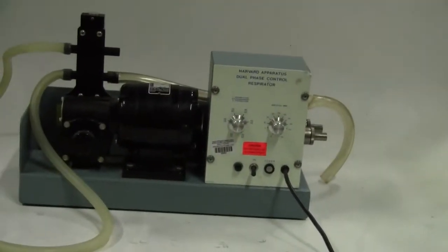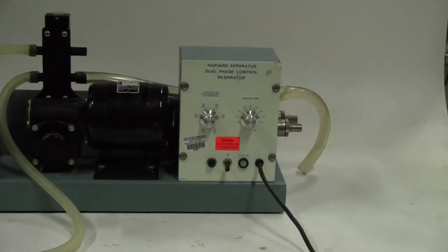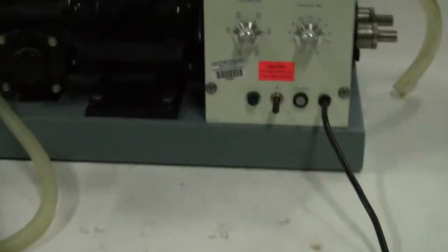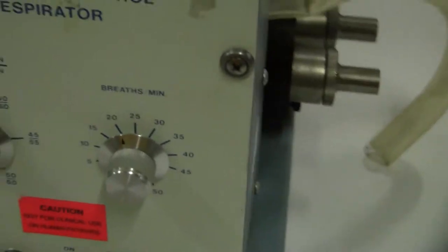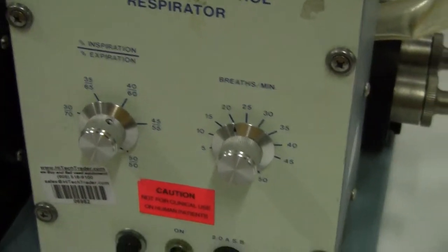Hi, this is Jim from HitechTrader. We have a Harvard Apparatus Dual Phase Control Respirator. It's for animals in the lab. This is designed for a larger animal, up to one kilogram and above.